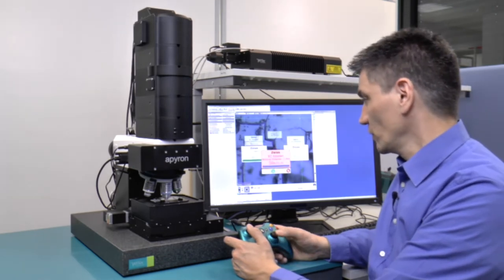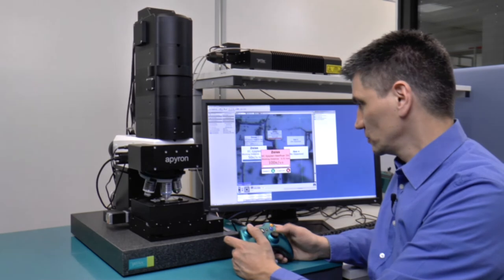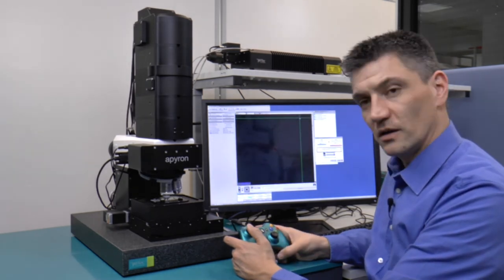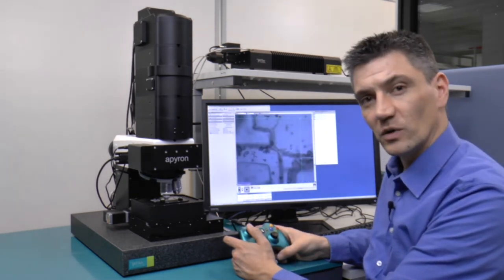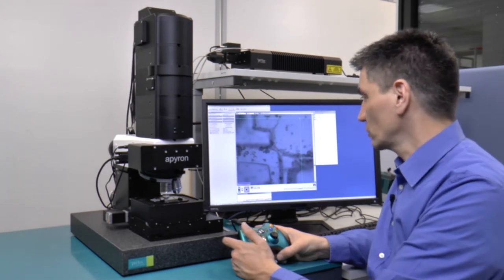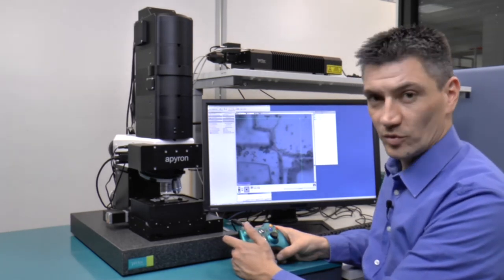If we go further to the 100x objective, we again see it does an automatic compensation for the XYZ and adjusts the illumination to be in focus exactly on the same position as before.